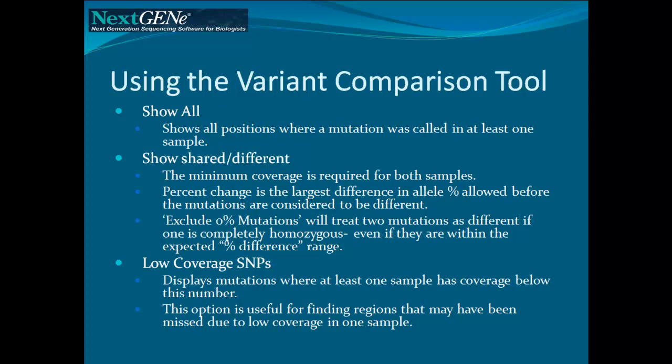The first 3 comparisons only use basic information. Show All will list any mutation present in at least one project. Show Shared will list mutations present in all samples. Show Different will list mutations that differ in 2 or more samples by a minimum amount.